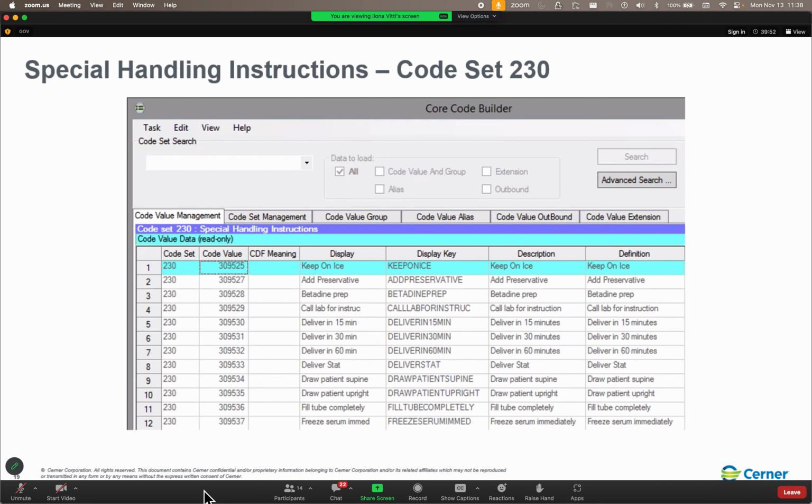So does anybody have any questions in here before I click save? All right, so click save, and then we're done in the collection requirements for now. So go to your lower right hand corner and click finish, and finish. Go ahead and get back to the main screen.